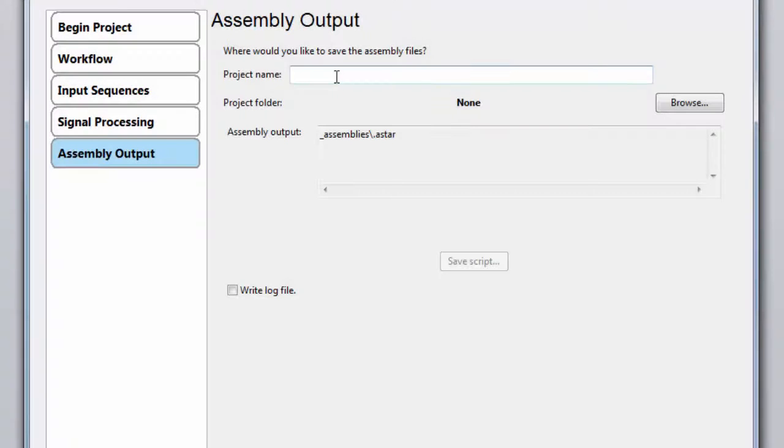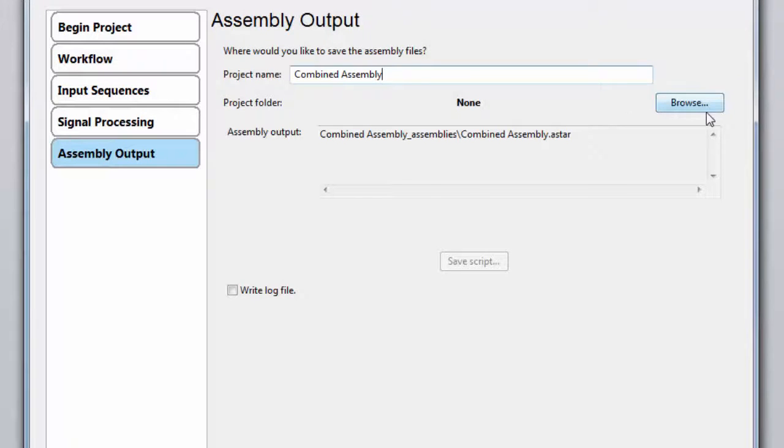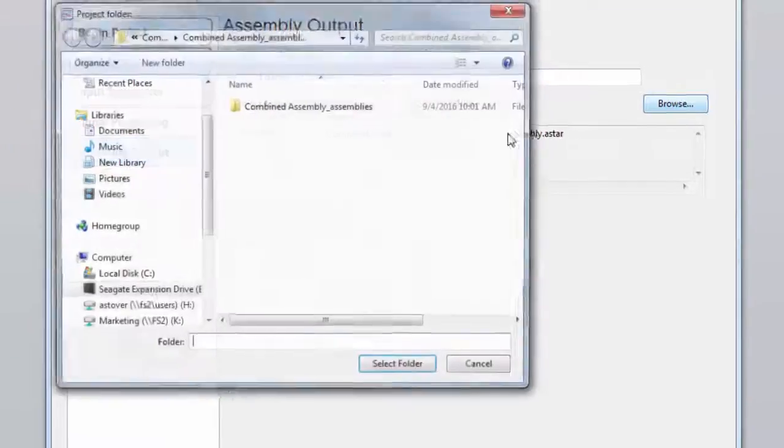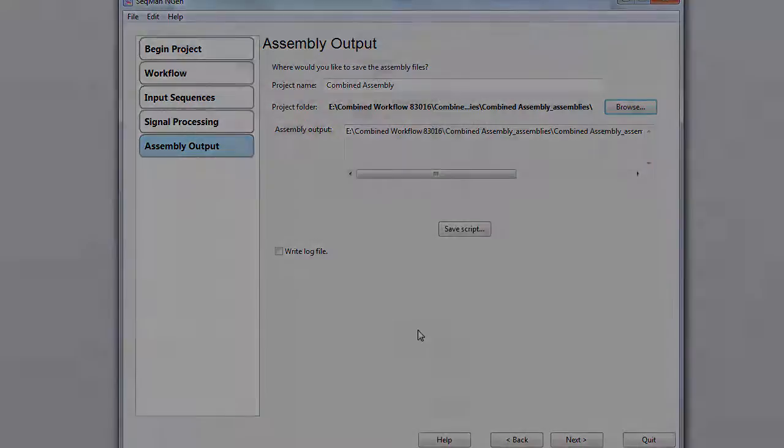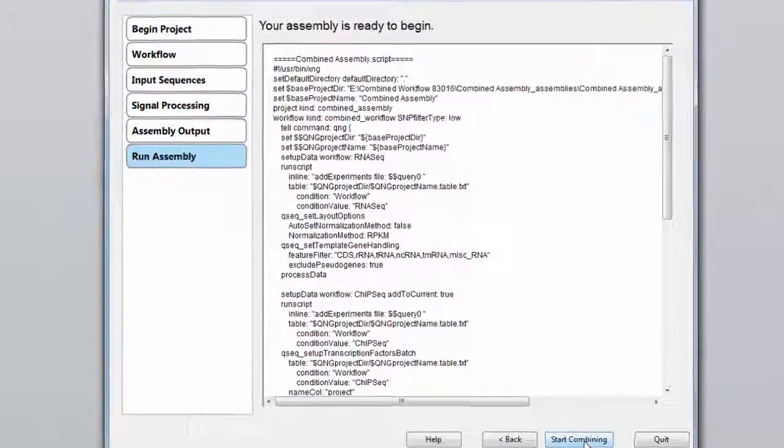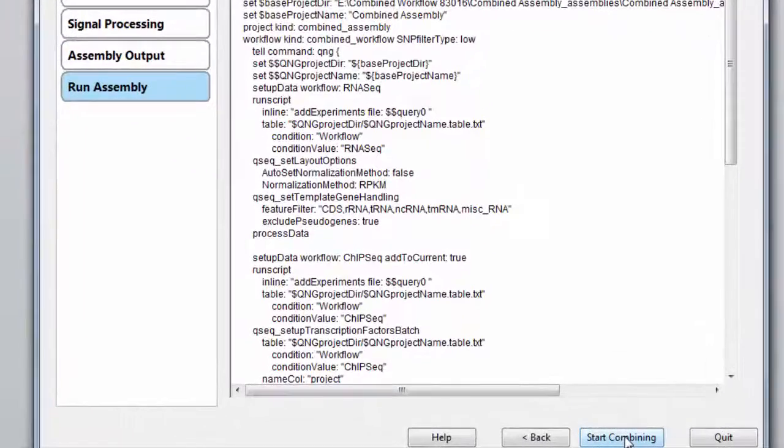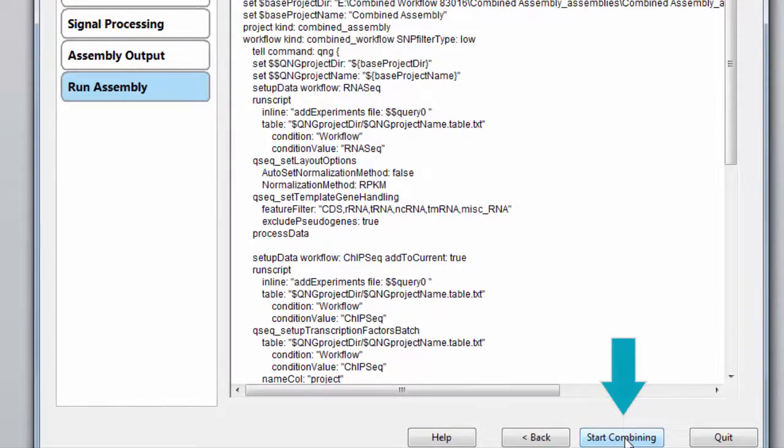Finally, we need to name our project and specify an output folder. Then, click on Start Combining to combine the projects.